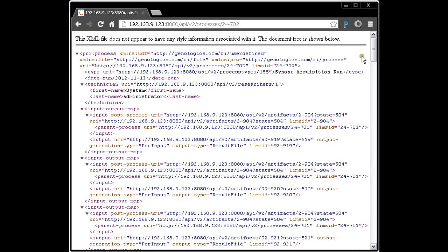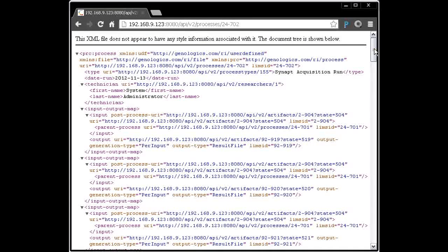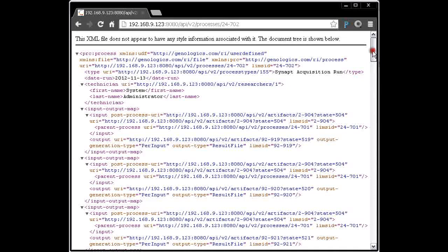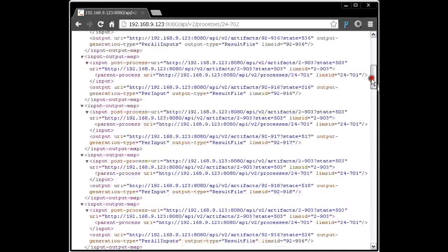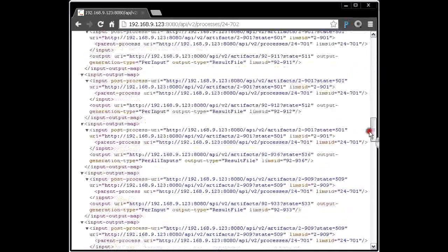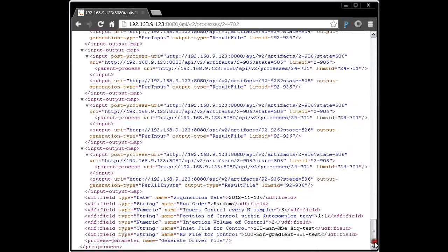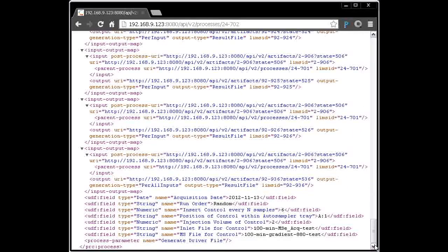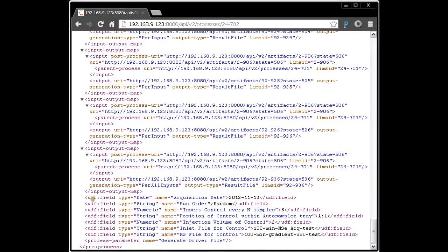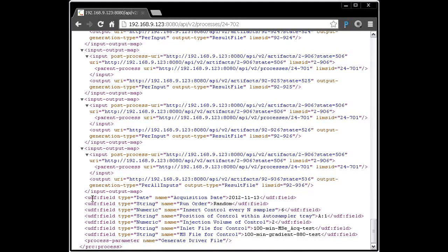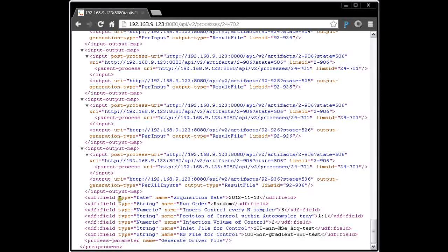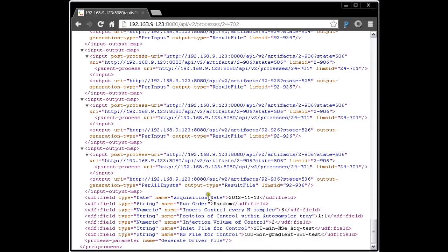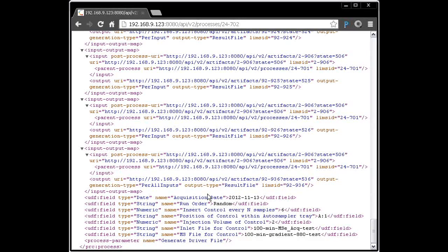The middle of the XML is made up of these input-output maps, which relate the inputs to the outputs. We'll be dealing with those in a subsequent session. And then, at the end, we have any process-level user-defined fields that are associated. In this case, I've got six or seven here which relate to the process that was run.